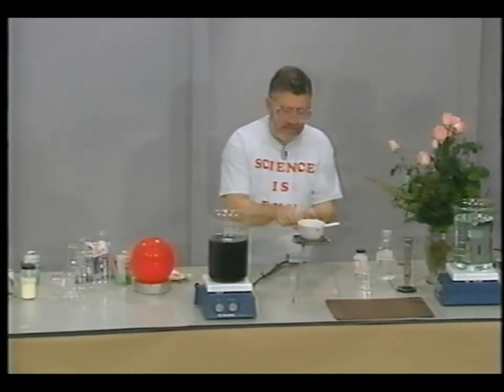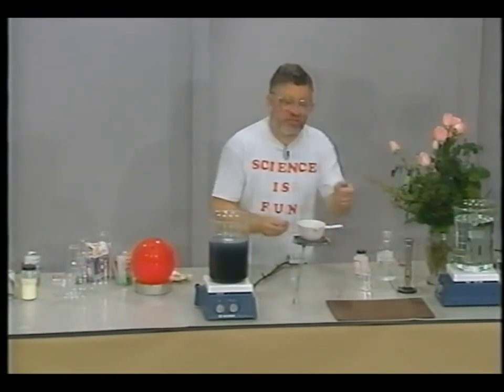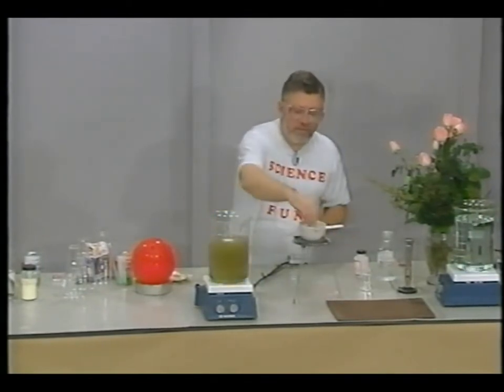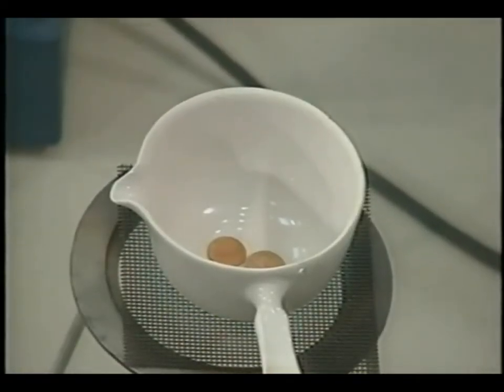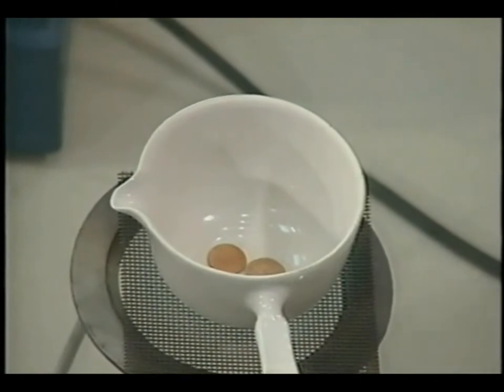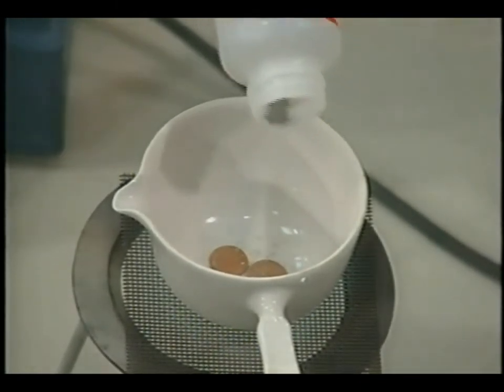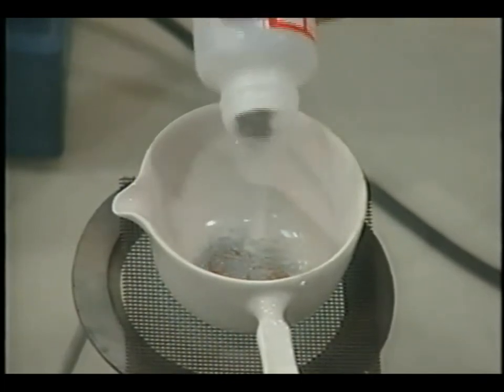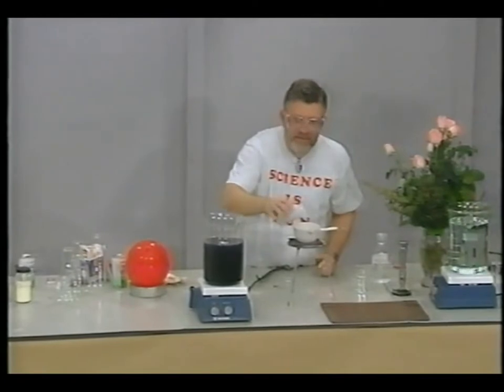So I'm going to take a couple of copper pennies, put them in this porcelain dish that has a handle, like so. Take actually 3 copper pennies, put them in there. And then what I'm going to do is take some metallic zinc and put some zinc on top of them. Okay, so they're kind of covered with zinc. They don't have to be completely covered.